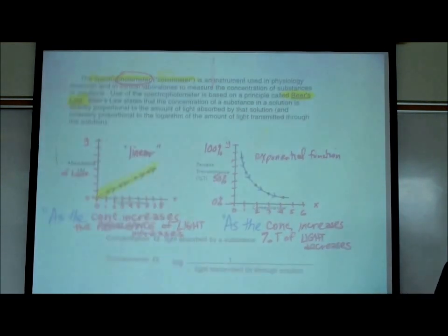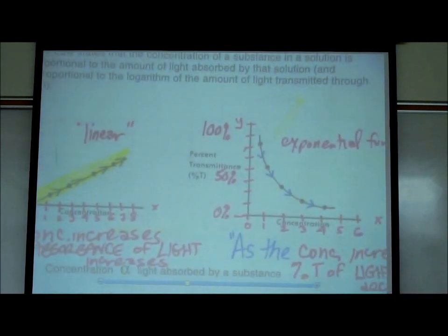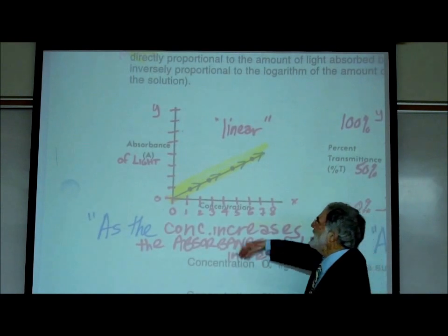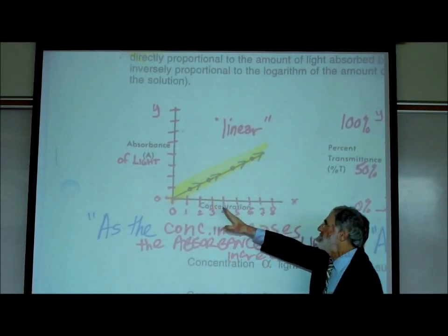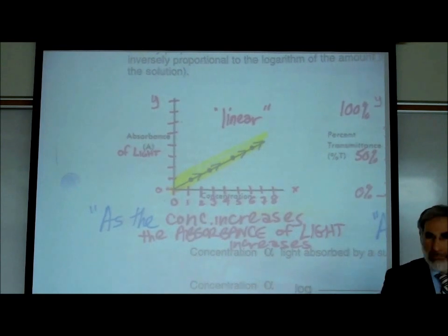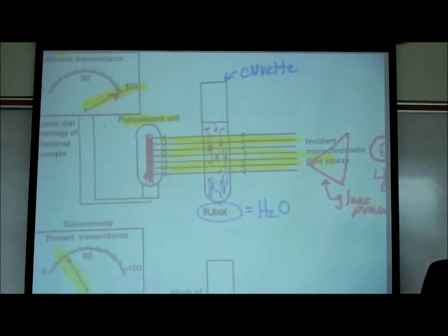Now, when you watch the video, you'll see me explain the relationship known as Beer's law, which basically shows that there is a linear relationship, a straight line relationship, between the amount of light absorbed by a solution and the concentration of that chemical in the solution. Now you might say, what does that mean? Well, mostly you're going to watch that video to find out, but let's show you this way. On page 2, let me put it this way.